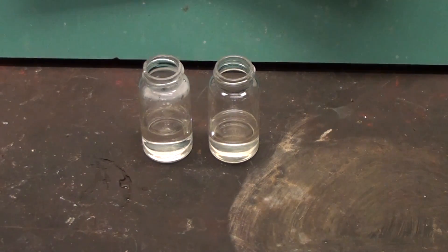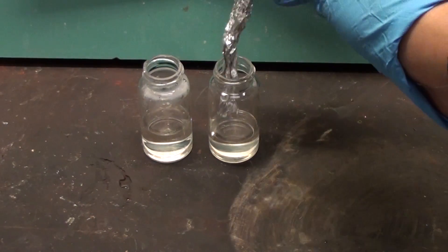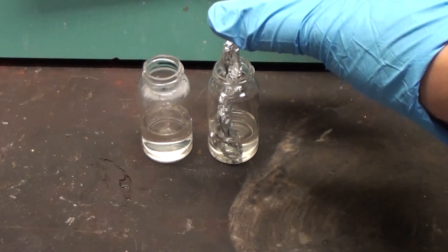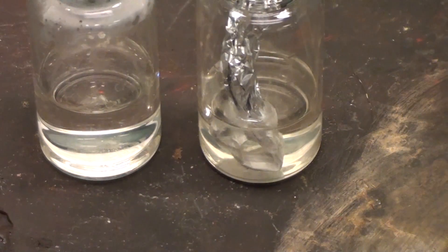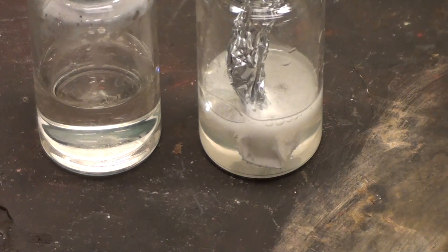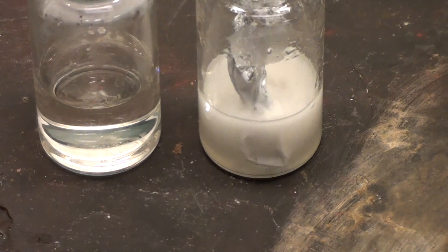Now I'm going to test the remaining sample with aluminum foil. Aluminum foil reacts with strongly concentrated sodium hydroxide to produce hydrogen and sodium aluminate. And there it goes. It looks like we have a decently strong solution of sodium hydroxide.